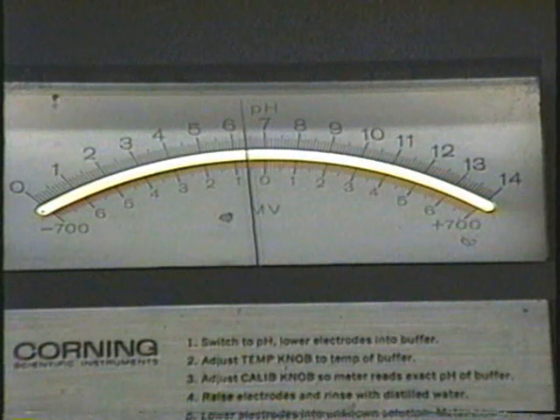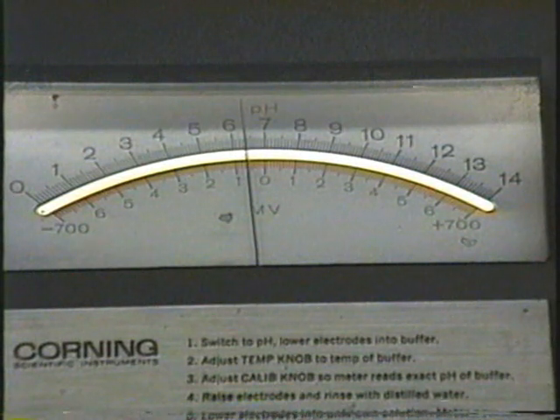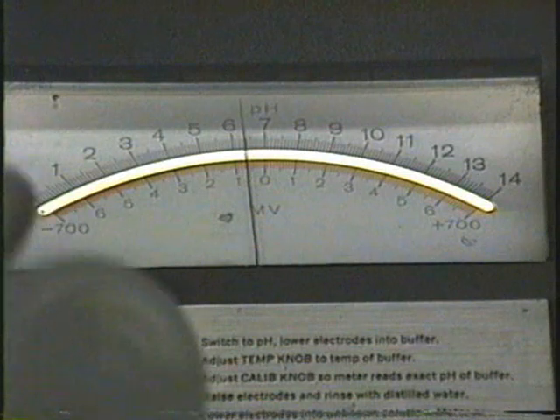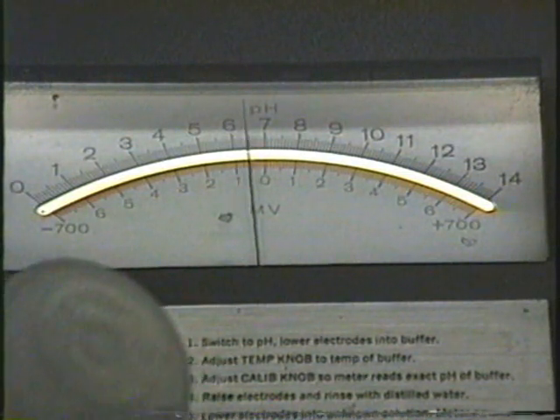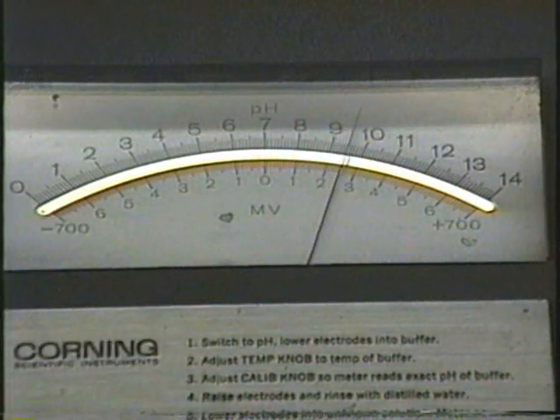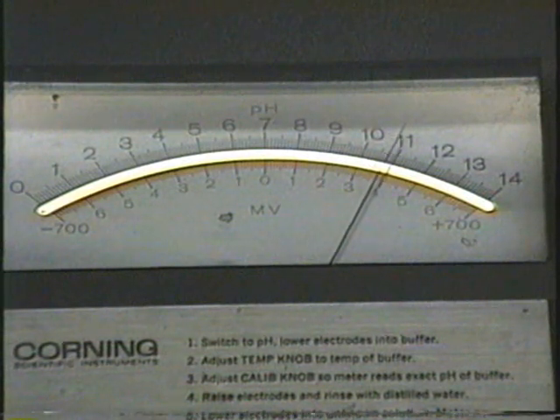Here's a close-up of that reading. As you can see, the water sample drifted down a little bit, and now it's reading 6.39, a pH of 6.39. Well, what we'll do now is put 10 drops of sodium hydroxide in here. All right, that's the 10 drops. And now I'll swirl the beaker, and as you can see as I swirl it, the pH is rising here.